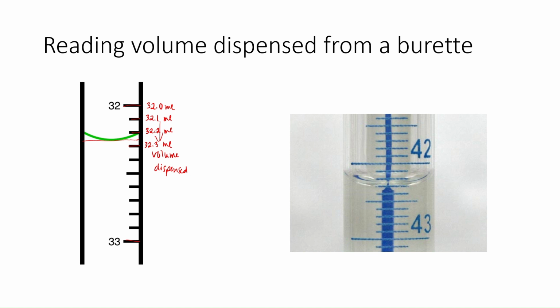So in this case, it's pretty clear that we're somewhere between 32.2 and 32.3, but we're going to add one more. So to my eye, this looks like it's about 32.26 milliliters.